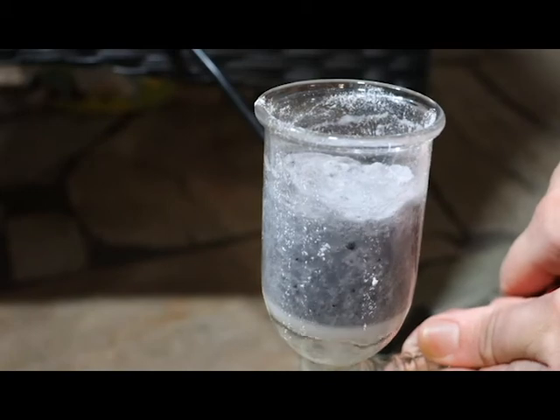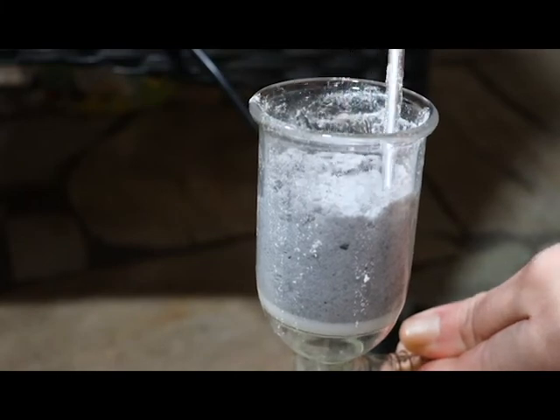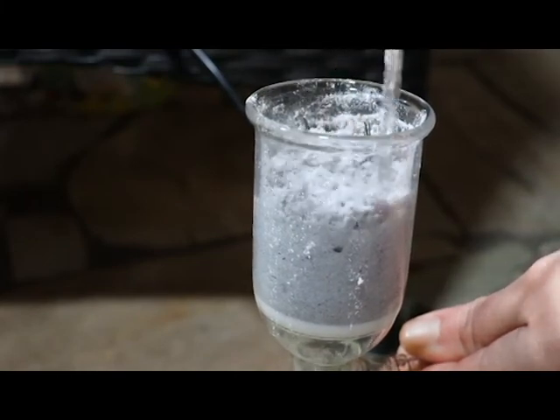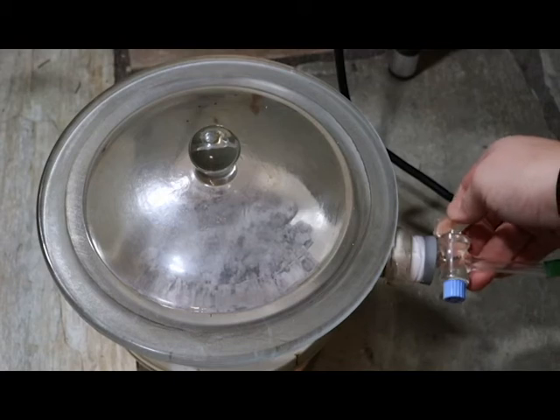And you can also use other solvents for this. You could also use dichloromethane. The important thing is just that it doesn't dissolve the oxalic acid, but dissolves your toluene and has a low boiling point.